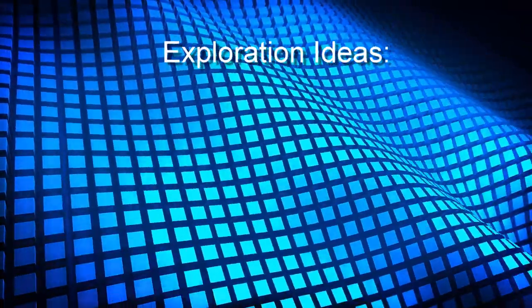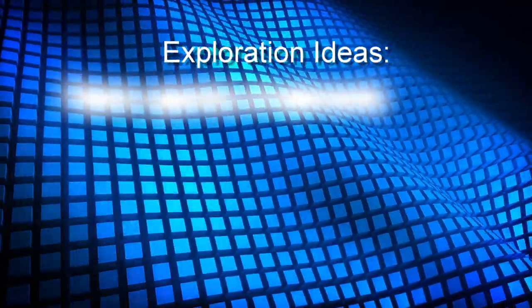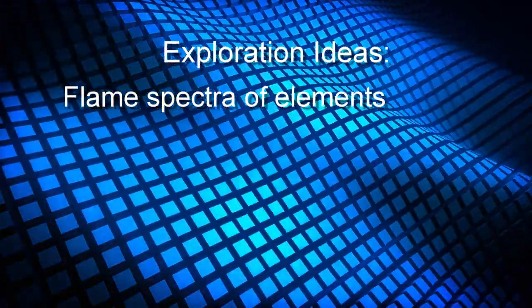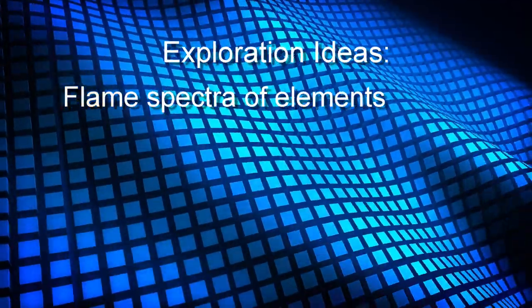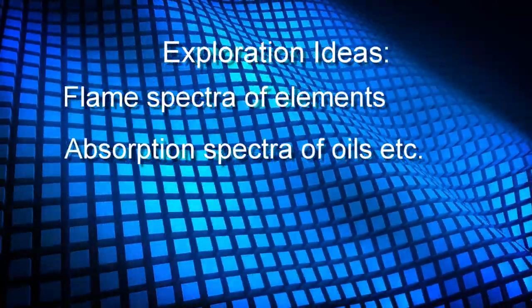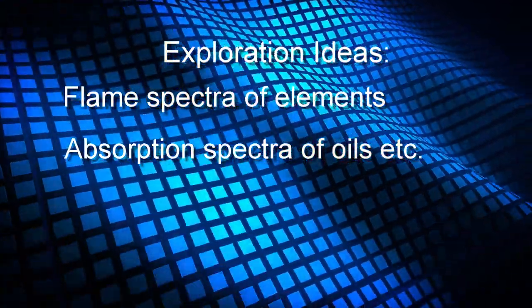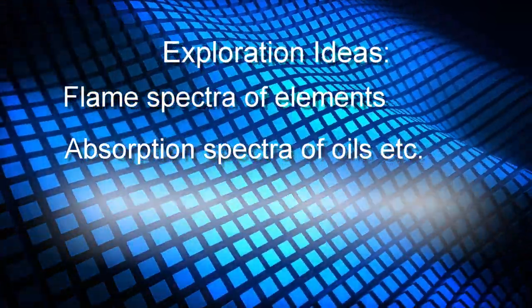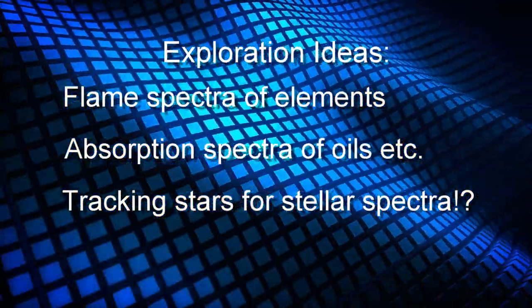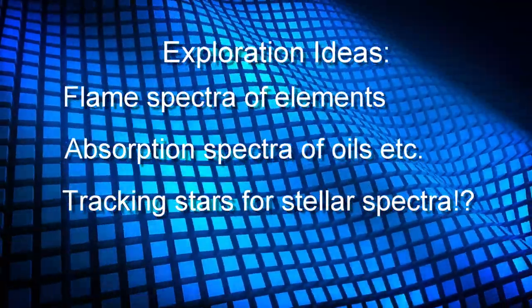Well, those are just some of the things you can do with your i-Phos. But there are many, many more, and here are some ideas. You can analyse the chemical makeup of elements and compounds by burning them in flames and looking at the spectra they give off. By shining a white light source through a substance and looking at the light that comes out the other side, you can also determine the chemical characteristics of the substance. I'm wondering if it's possible to use this instrument with a suitable star tracking system to collect the spectra from stars.